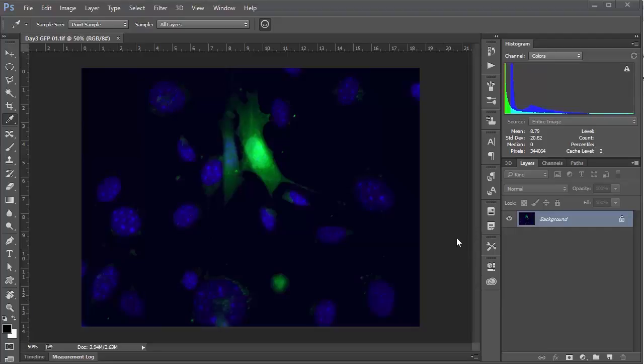Believe it or not, Photoshop actually has some pretty useful measurement tools, which I think are underappreciated. One of these tools is the count tool, which is especially useful if you're doing things like counting cells.